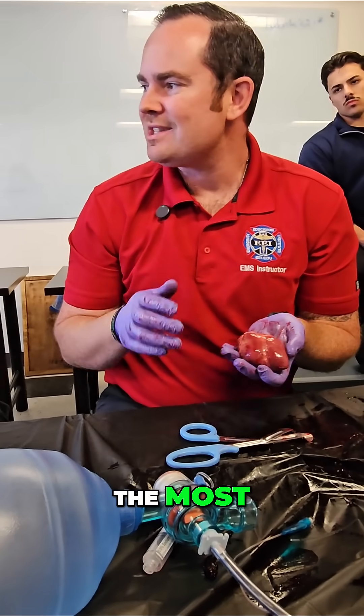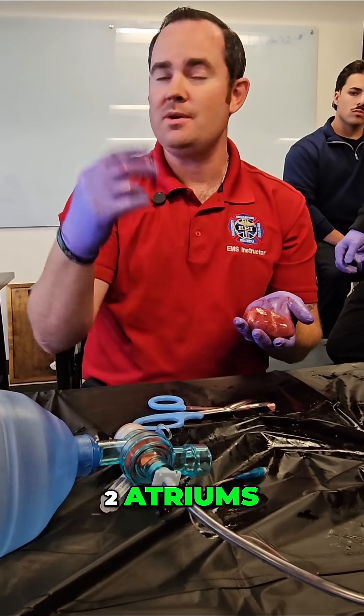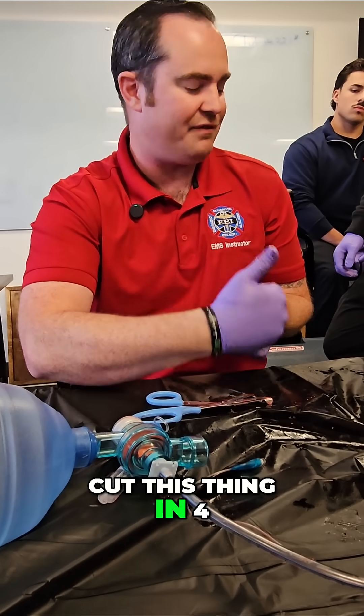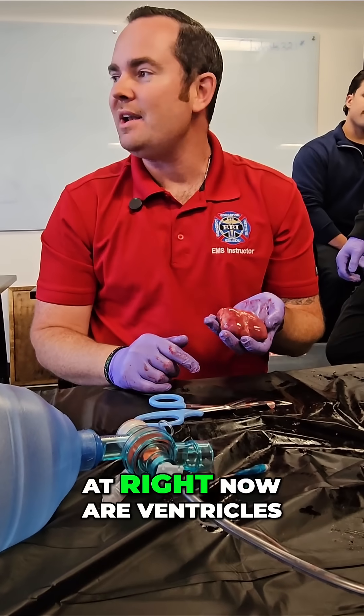Now, most times when students look at a heart, you think of the atrium — two atriums, two ventricles. And you would probably, in your mind, cut this thing in four, am I right? Believe it or not, everything that you're looking at right now are ventricles.